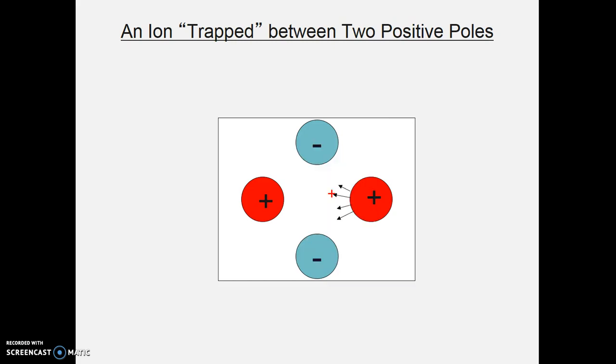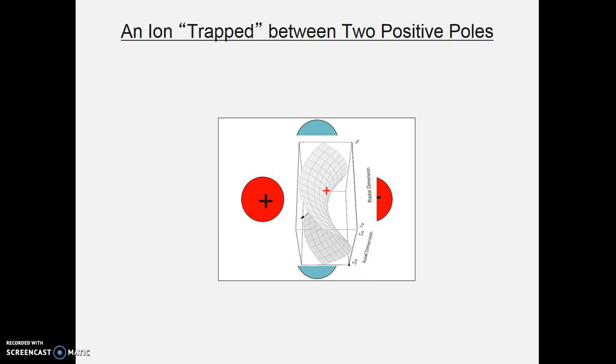Okay. So back to here. Here's the ion. It has this crazy shaped field. Now we know it's just not bouncing back and forth. It's actually kind of doing all kinds of neat things. It's like, whoa, I'm going this way and I'm going that way, but I get over here and oh, I feel the field, and I feel it really heavily once I'm close to the poles. All right, this is your qualitative field or feel for this.